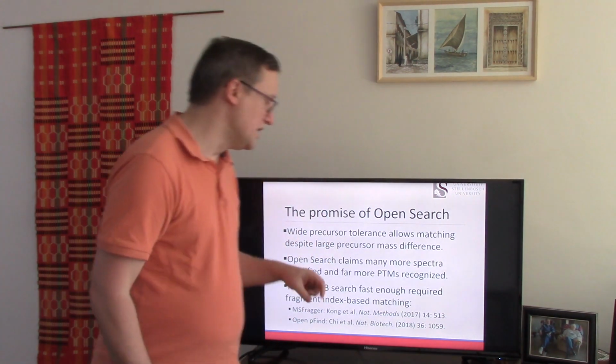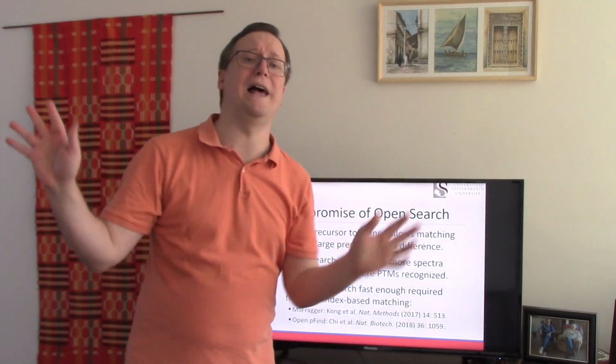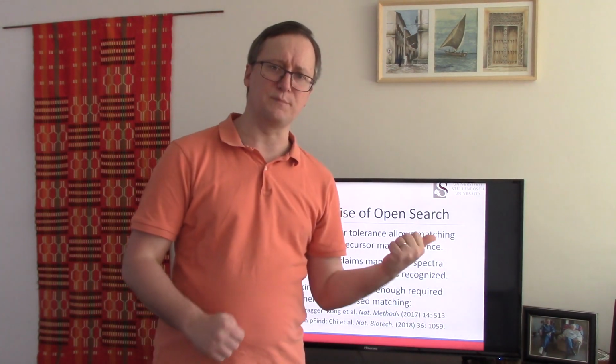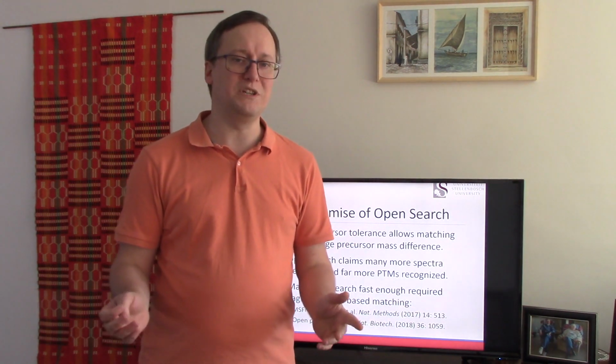So they also claim that they're going to recognize a far broader palette of post-translational modifications than you could with database search. So more of your data explained, more PTMs recognized. What's to lose, right? I would have to say that both of these claims should be taken with a pretty large rock of salt.